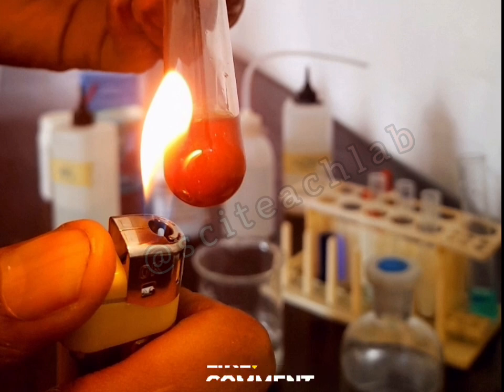So in exam conditions, you will be given steps, as those are tests, and then you could be asked to supply the observation and then infer what your observation tells. So we're going to see some tests to start analyzing this salt.